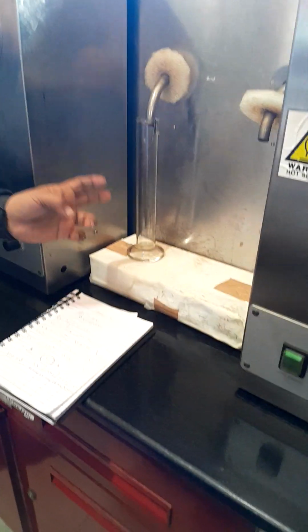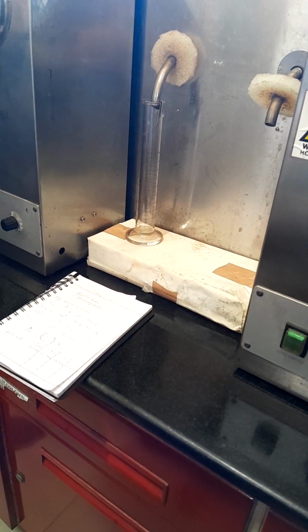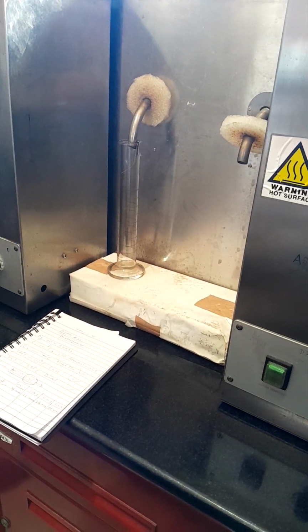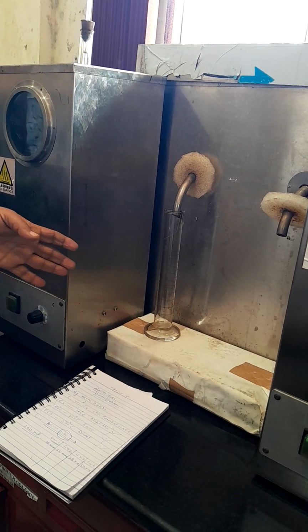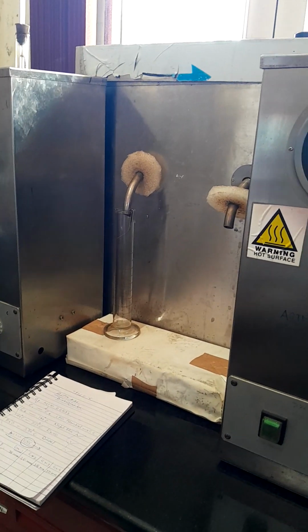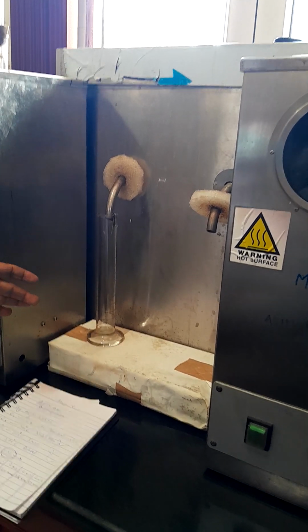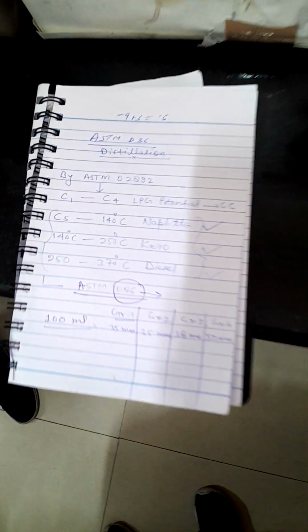Similarly, the receiver where you are getting the distillate will also be at 0 to 4 degrees. But in diesel cases, when you are doing the distillation of diesel, the condenser should be kept at 55 to 60 degrees centigrade. It is not required for gasoline. For gasoline, both the condenser as well as the receiver should be at the same temperature, which will be 0 to 4 degrees centigrade.